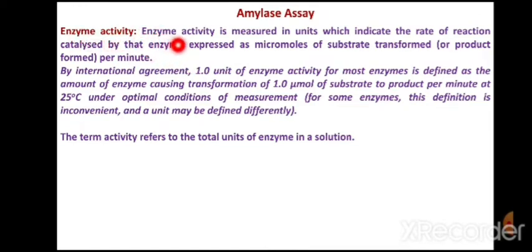Enzyme activity is always measured in units. We call them enzyme units. These units indicate the rate of reaction catalyzed by that enzyme, and that is expressed in terms of micromoles of substrate transformed or micromoles of product formed per minute. That is the definition of enzyme activity.